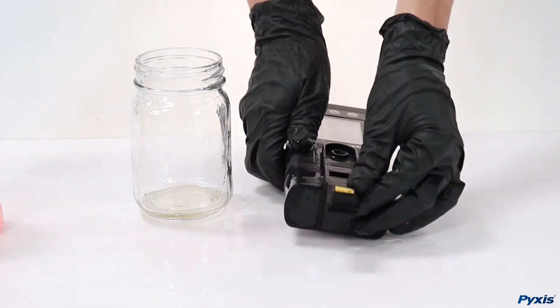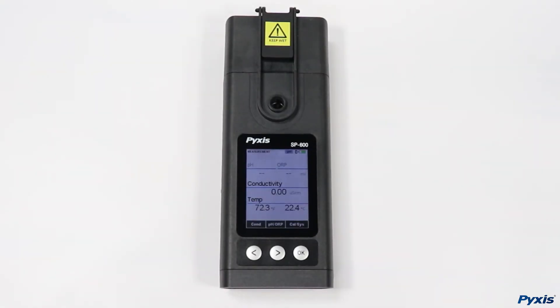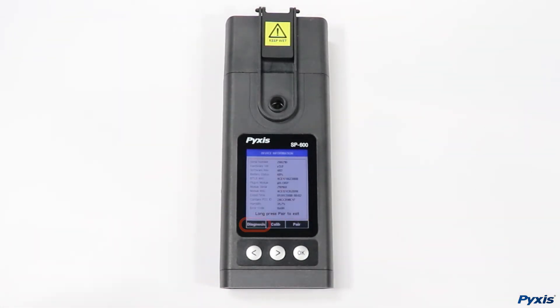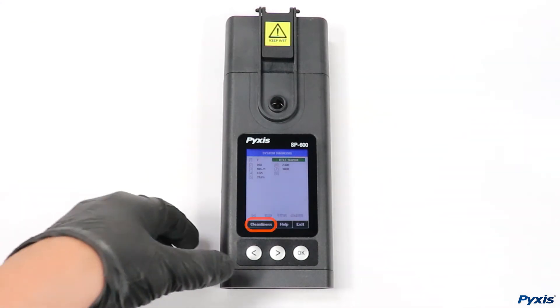Your handheld is now clean and ready for testing. To double check, you can perform a cleanliness check by entering the calibration and system menu and then selecting diagnosis, followed by cleanliness.